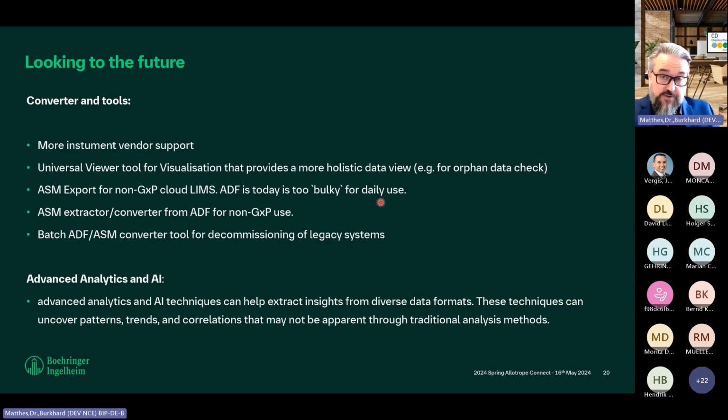I've shown you a demo sequence with 3 sequence lines, and that ends up in an ADF file from 30 to 40 megabytes. When we have a production run, a GMP sequence that has 20 to 25 sequence lines, that results in an ADF file from 600 to 800 megabytes. We have 18 systems in our lab. We have more than 300 in our area and thousands in our company.